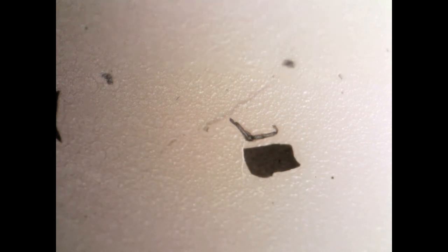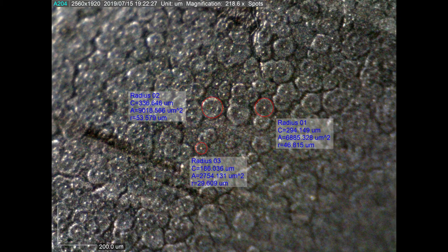Going back into the dimpled area. I think you get the idea. It seems to be a transition where they are very densely packed. You get the deep, thick carbon where they seem to be overlaid. Where they're quite densely packed but fairly not laid, you get a fine layer of carbon. And then it just gets very thin as they get smaller and fade into the smooth surface.